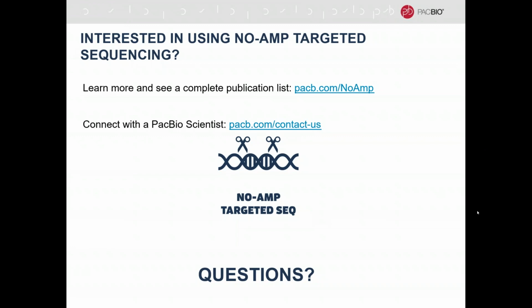In general, there are lots of questions, which is great. There are a lot of questions around the size of the insert that we've looked at, and how big would you expect we could go? So can you talk a little bit about that? Yeah, so basically in-house, we have mostly focused on 4 to 6 kb sizes, and that's mainly because we've been looking at repeat expansion disorders, and we can confidently capture most of those with that insert size.